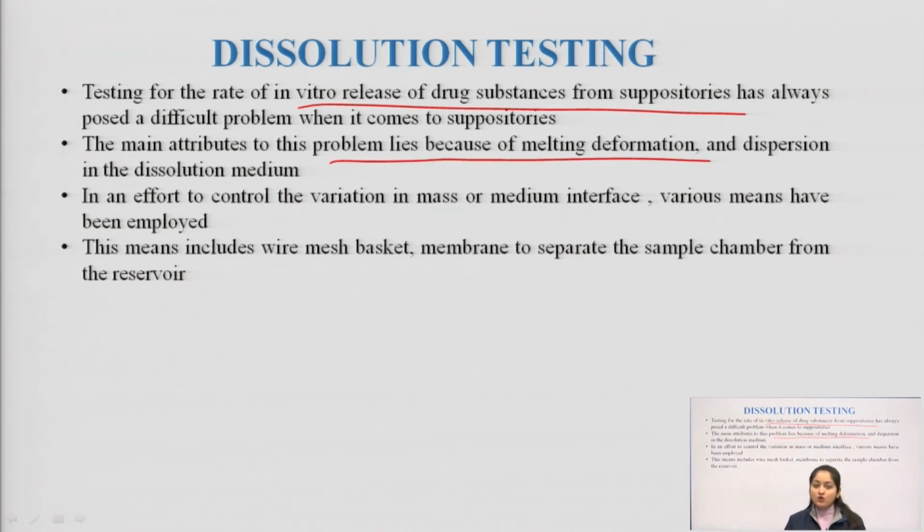What happens when you want to test the dissolution of suppositories outside their packaging is that sometimes, when you take the suppository out of its packet, softening has already happened, or liquefaction has already been achieved. So testing the dissolution parameters of suppositories is quite a challenge for researchers, academicians and students.